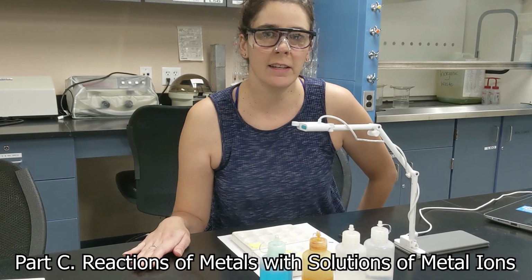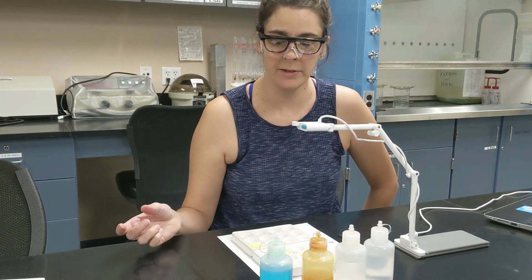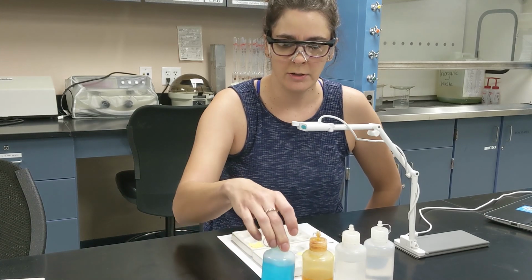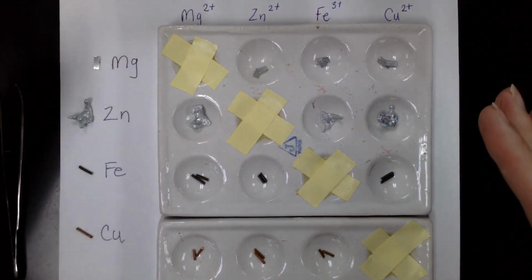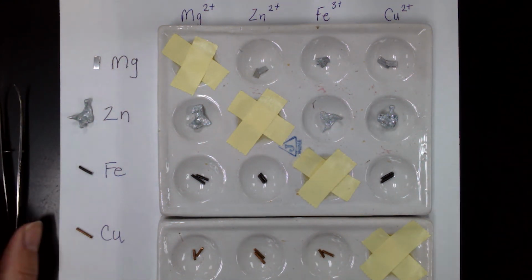Okay, so for part C of the lab, we are looking at different metals that may or may not react with metals in solution. So we're looking for single displacement reactions with 2 metals. So in the well plates here, we have all of the metals. So it should look just like it does on your report sheet.